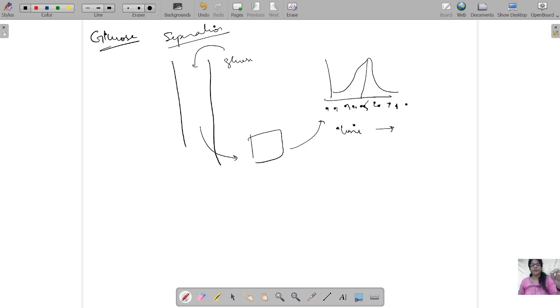After injecting the sample into the column, you got a peak at 5 centimeters, which says that the retention time for glucose is 5 minutes.